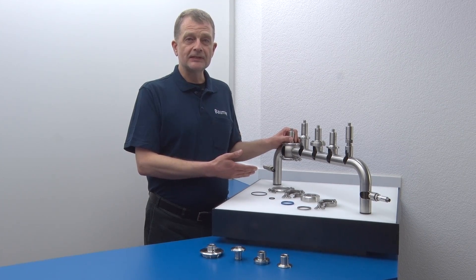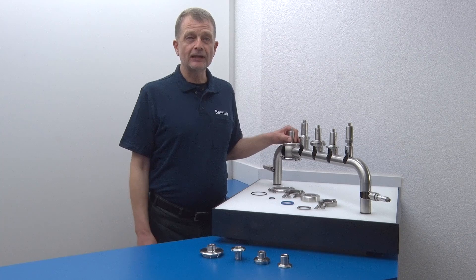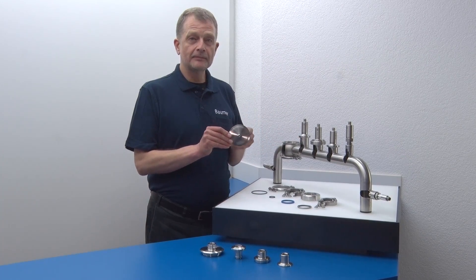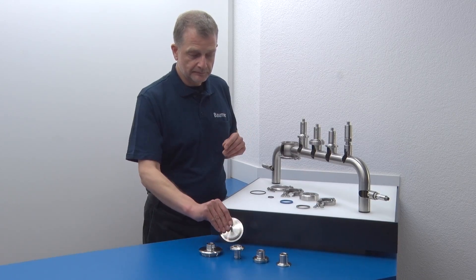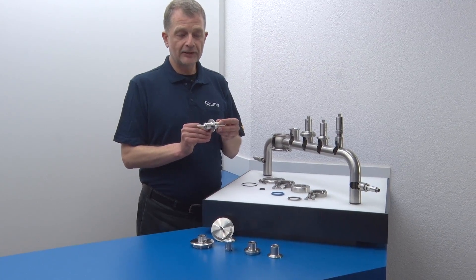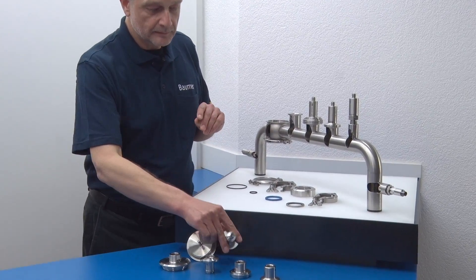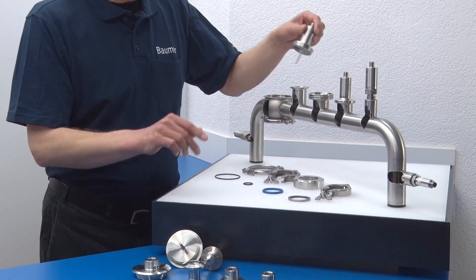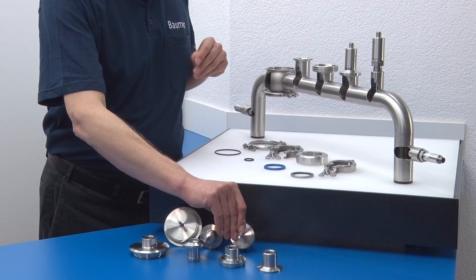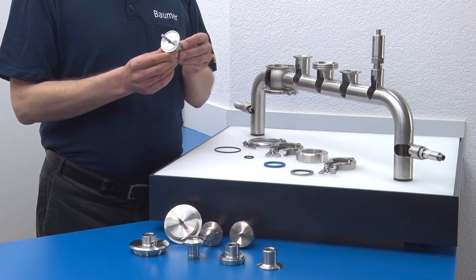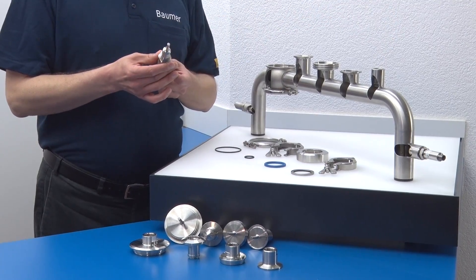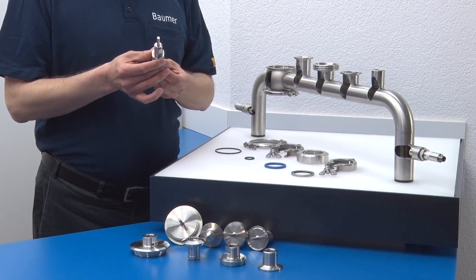Here, you see some process connections typically used in hygienic sensitive areas in the food and beverage industry. VeriVent Connection, Bomber Hygienic Connection, Dairy Pipe Connection, Clamp Connection, and finally, Half-Inch Hygienic Connection.